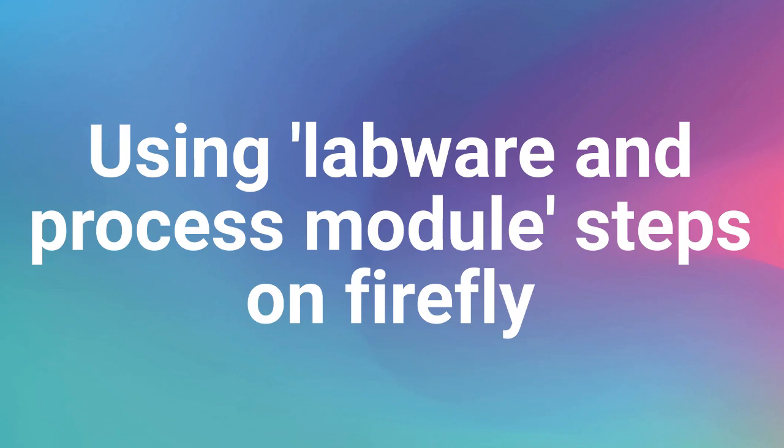Hi guys! Today we are going to go through what the labware and process module steps do and how they can be used when writing protocols on Firefly. There are four main labware and process module steps.